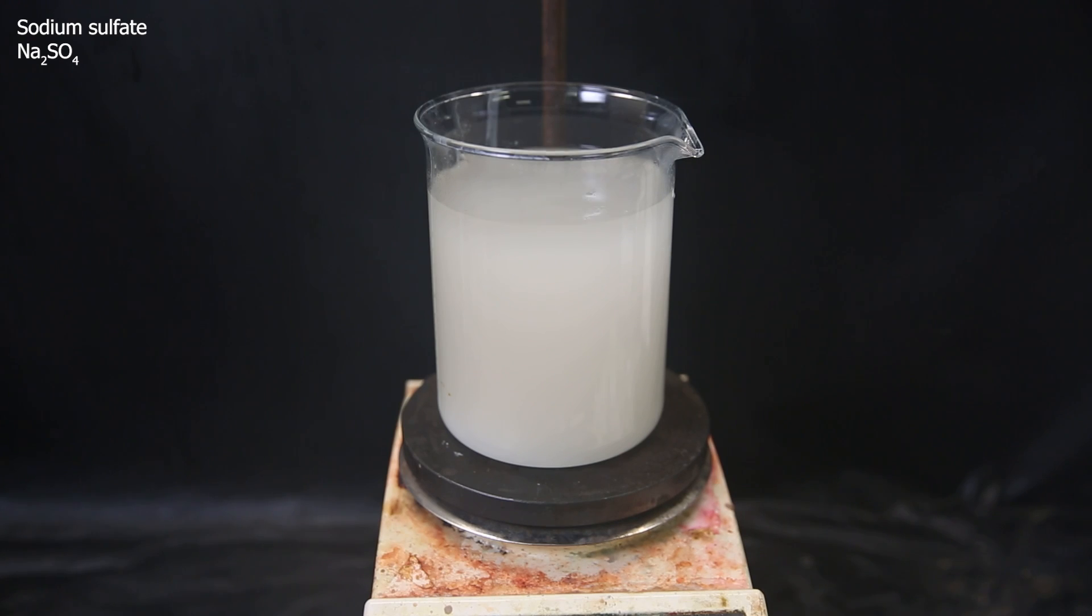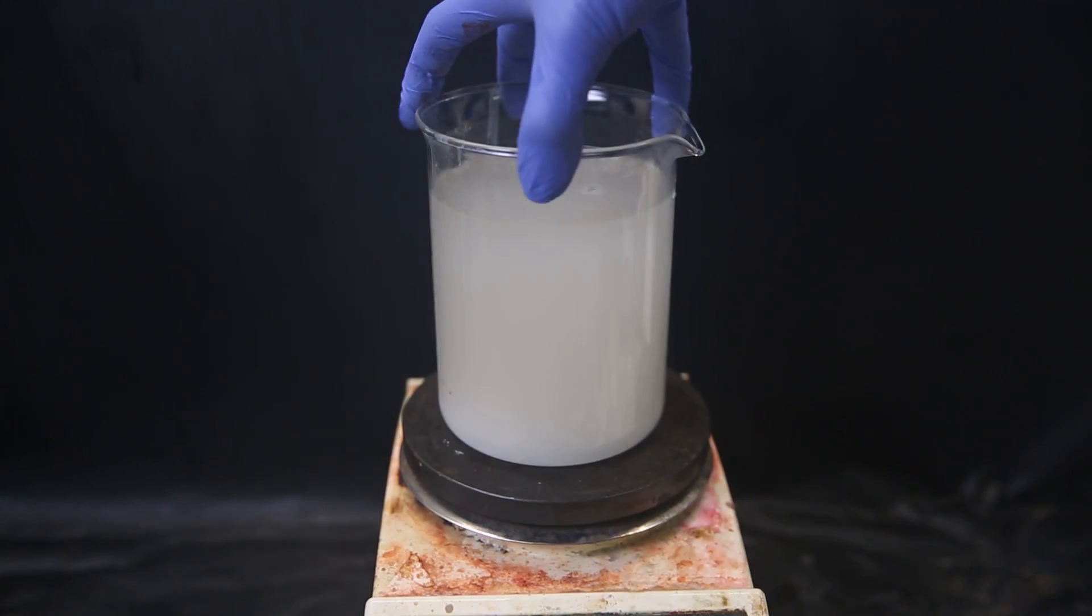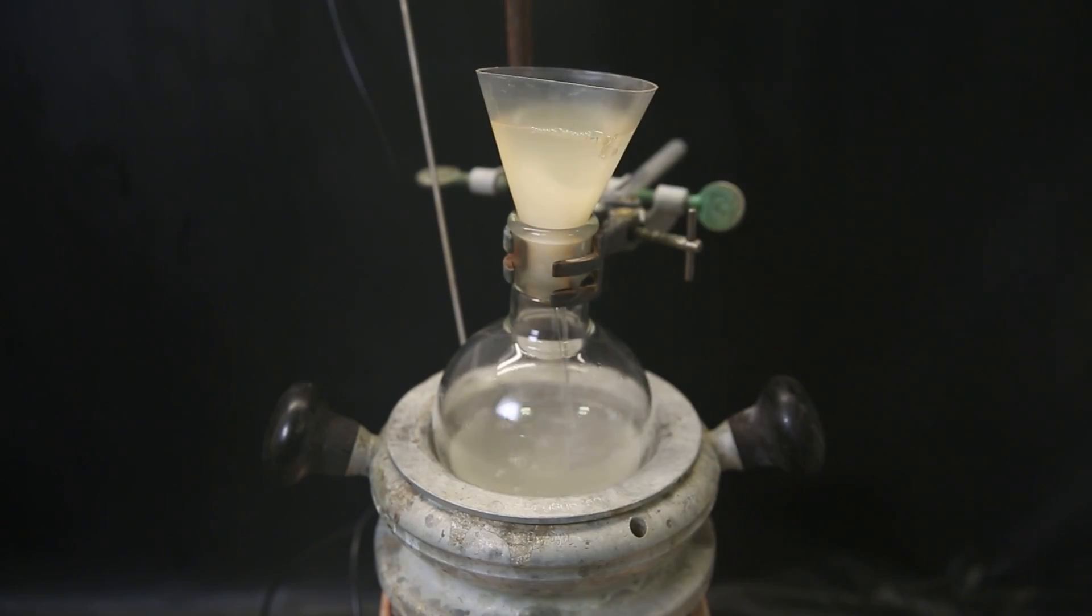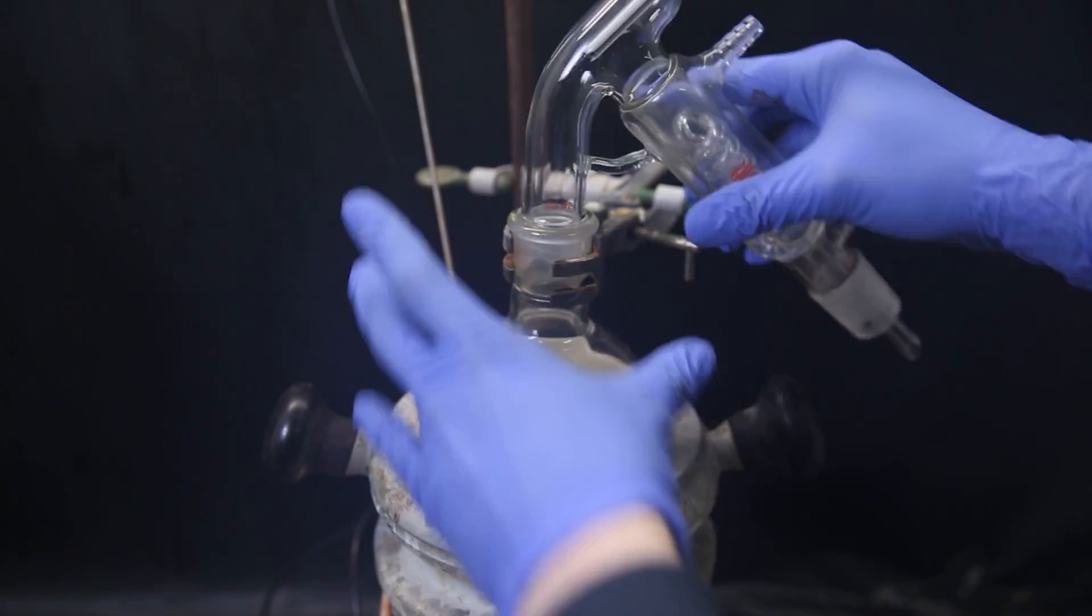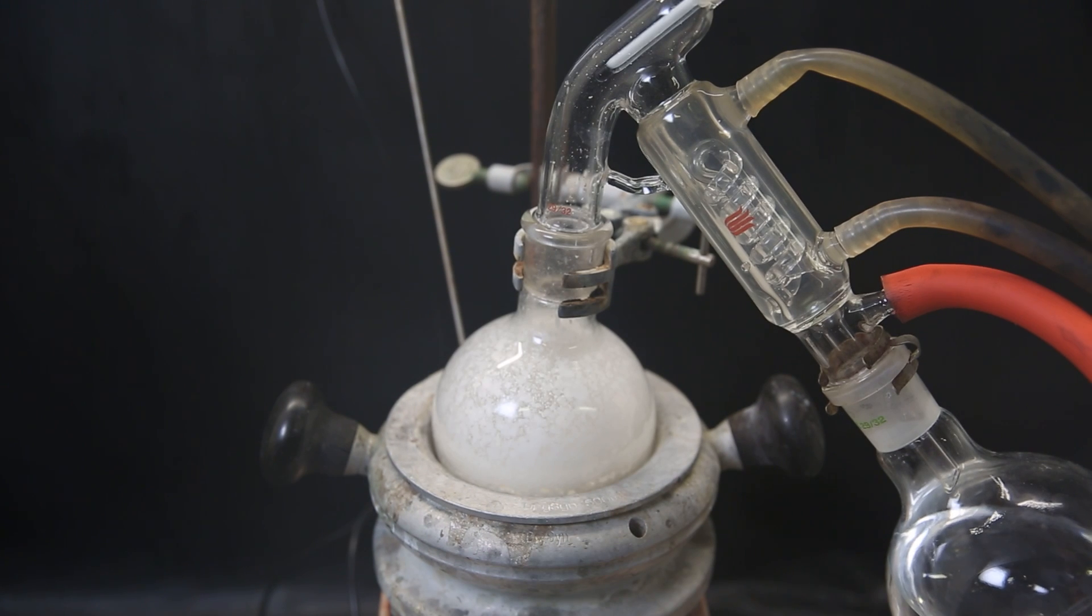The transparency doesn't really change. And I then filter it all through some cotton directly into a flask to remove the sodium sulfate. I set this up for vacuum distillation to remove all the solvent, giving an off-white solid.